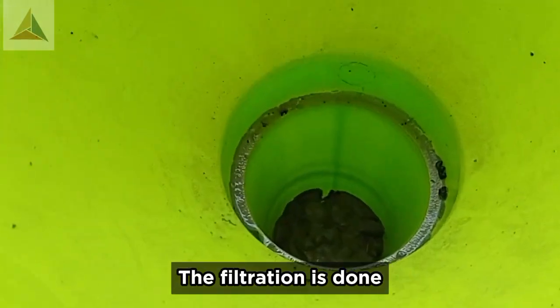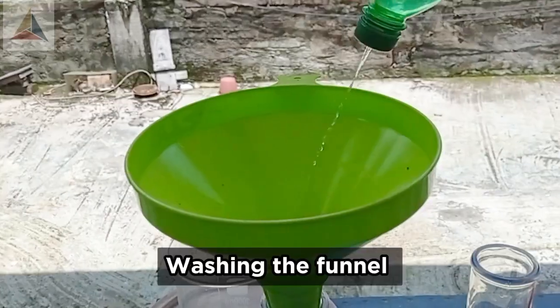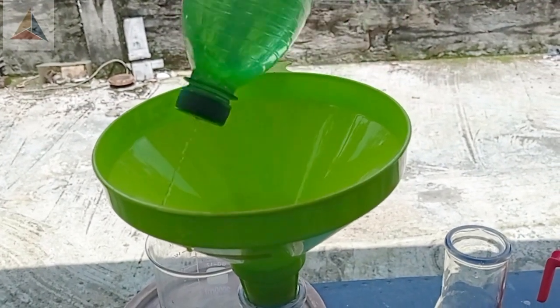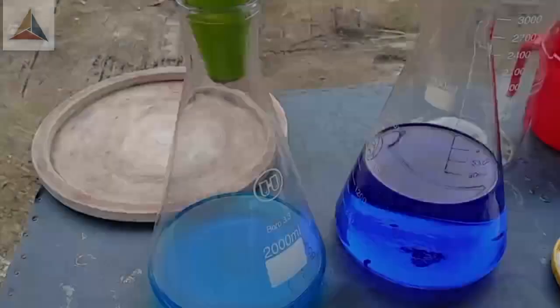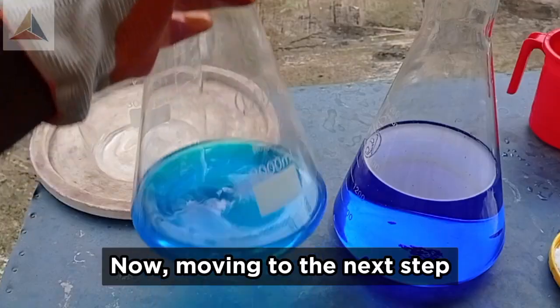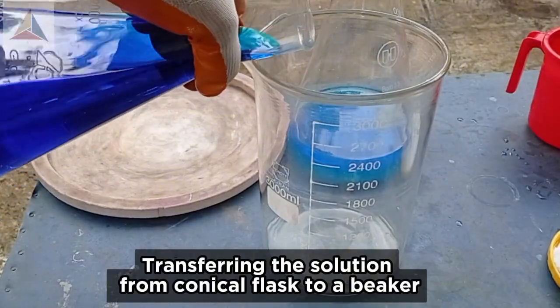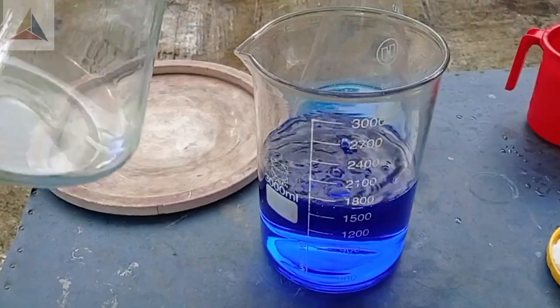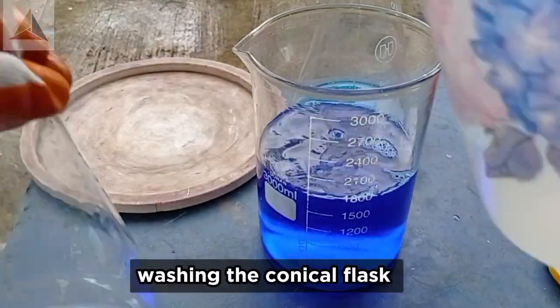The filtration is done. Washing the funnel. Now moving to the next step — transferring the solution from the conical flask to a beaker. Washing the conical flask.